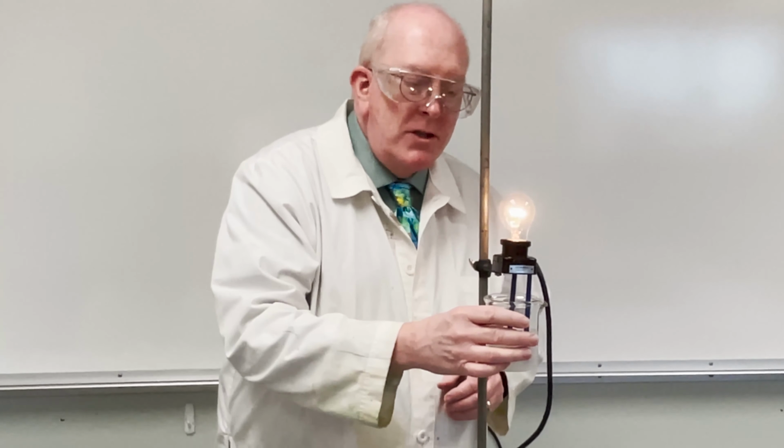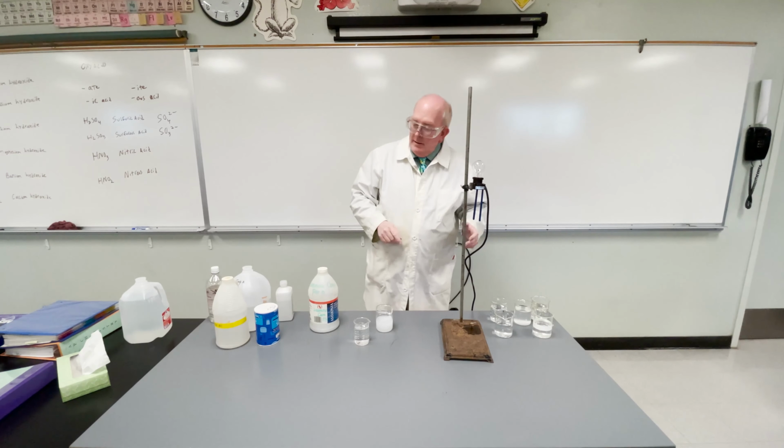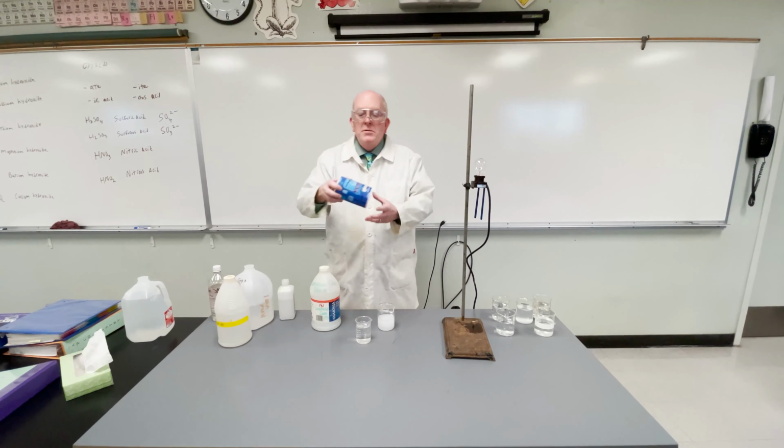So, let's recap. Things that are strong electrolytes dissociate fully, like table salt, like hydrochloric acid, like sodium hydroxide. Sodium hydroxide and hydrochloric acid, strong base, strong acid. Then we have a weak base and a weak acid with the ammonia and with the vinegar. They only partially dissociate, so they have a very weak ability to conduct electricity. The glow is dim. And for the strongs, the glow was very bright. And for the non-electrolytes, like alcohol, there was no conduction whatsoever.